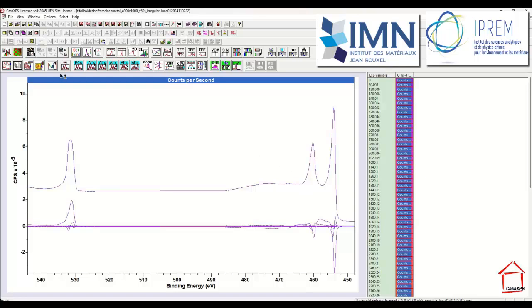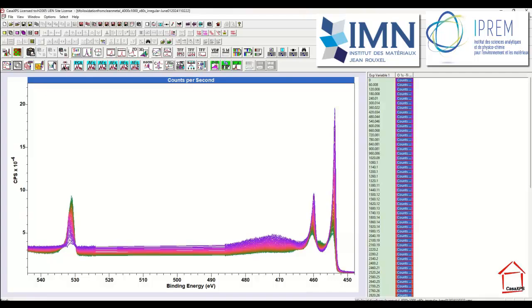So I need to reconsider which part of this experiment I'm going to apply the techniques that I'm about to illustrate. So the idea is to find a part of this experiment where the variation is occurring, but it's only occurring by 2 spectra combining to form these variations. In other words, a 2-dimensional space.